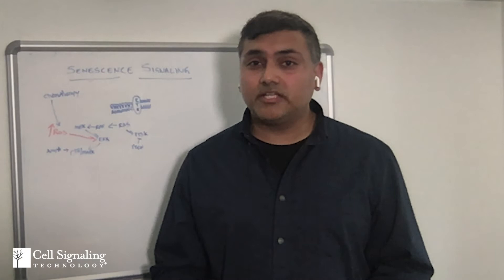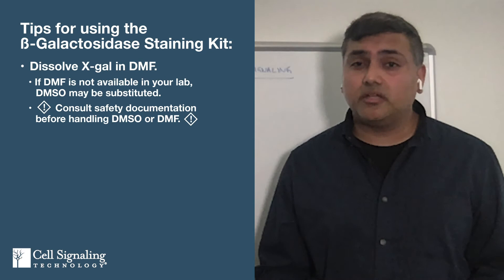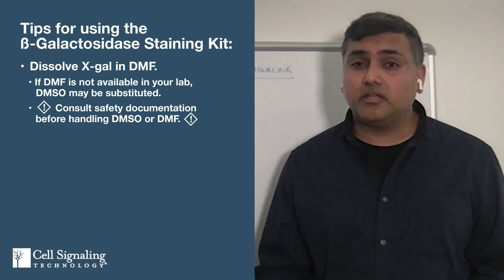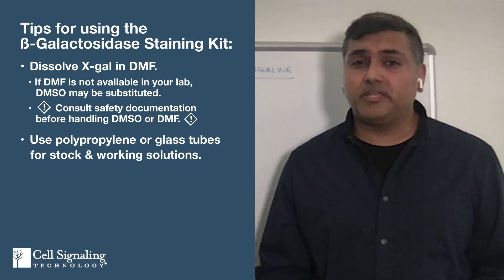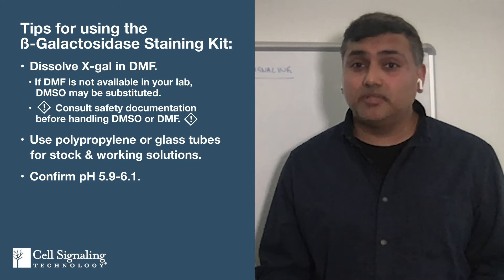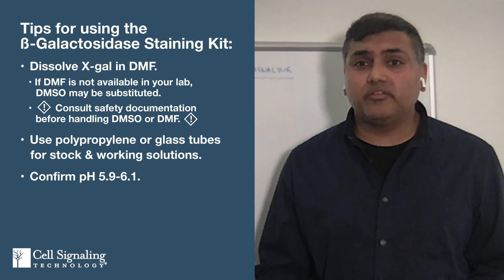Our scientists often receive tech support calls about blue X-gal crystals appearing in samples, making it hard to interpret results. To avoid this, dissolve X-gal in the solvent DMF to make your stock solution—use polypropylene or glass tubes, since polystyrene is not compatible with DMF. Check the pH of a diluted X-gal staining solution: if pH is too low, you'll get false positives; too high, false negatives. Confirm the pH is between 5.9 and 6.1 and adjust as necessary after adding X-gal. Finally, seal your plates with parafilm or a tight cover to prevent evaporation, which can contribute to crystal formation.